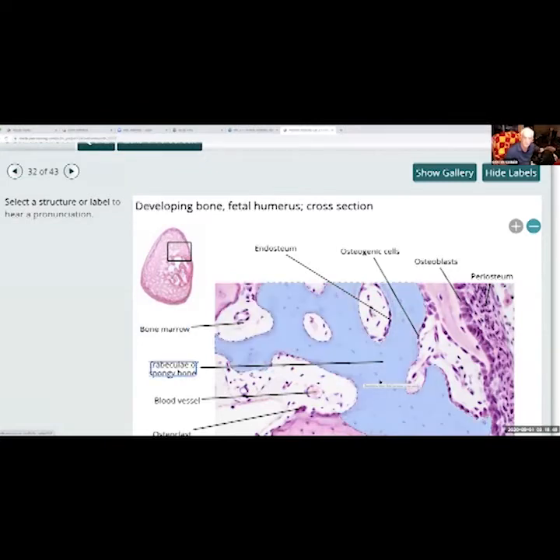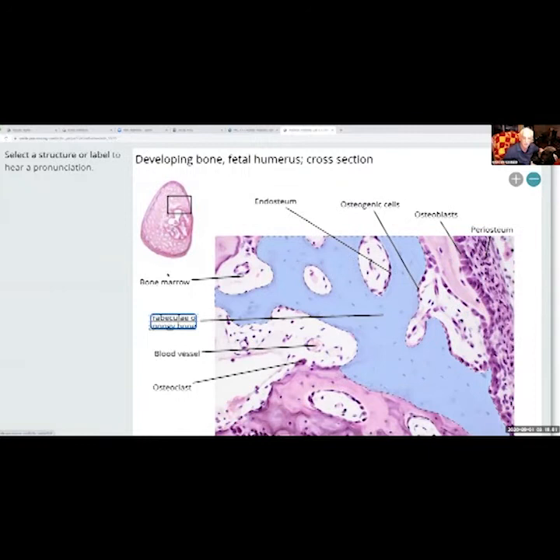See how, look at the difference between this bone. See how it's formed all this space here? This is bone. Okay. And the other bone with all these small circles, very, very compact. This is more spread out. Okay? So this is your trabeculation. This is your spongy bone. The other one was your compact bone.